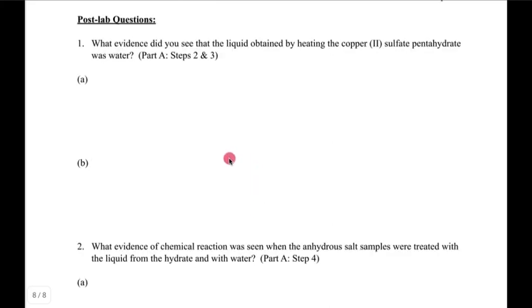Post-lab questions, in terms of evidence about the sample, the water coming off. Did it look like water? What are the properties of water? Did it agree with that, just from your general knowledge? And then the other answer part here would be the test strip. Does the change in the test strip confirm that it's water?